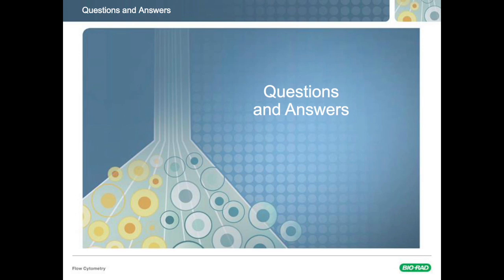Okay, here's a re-explain question, Dan. Can you re-explain the importance and how the charge phase works again? Yeah, absolutely. And it's kind of funny because the charge phase is almost like this little thing that's thrown in. All of the other pieces kind of go in this nice linear order, and then charge phase is just this random time between 0 and 360 degrees that ties it back in.